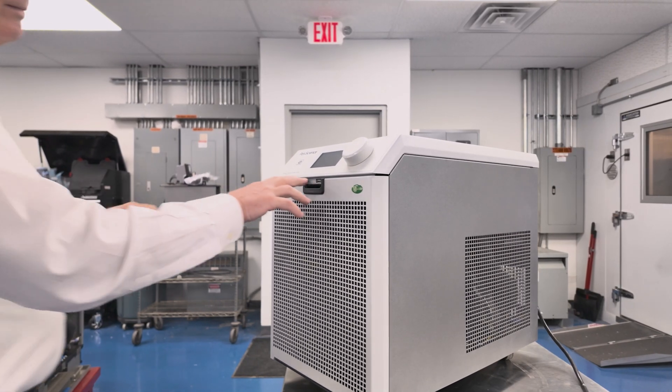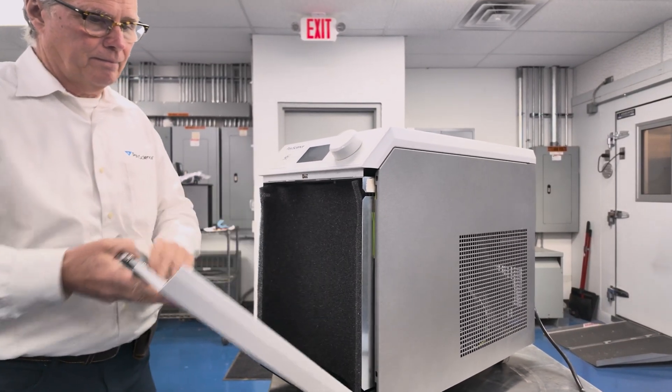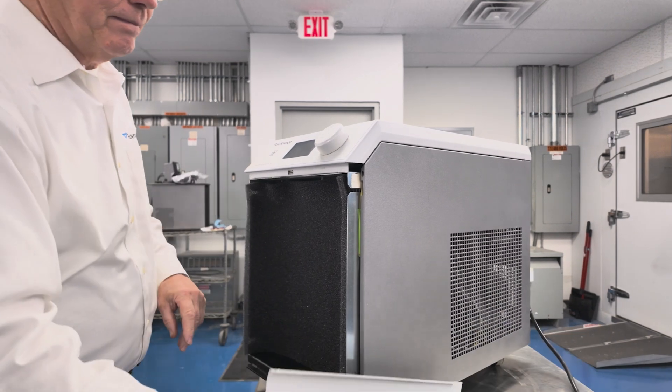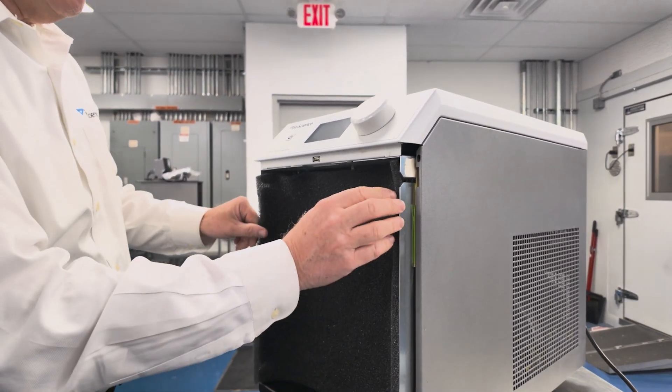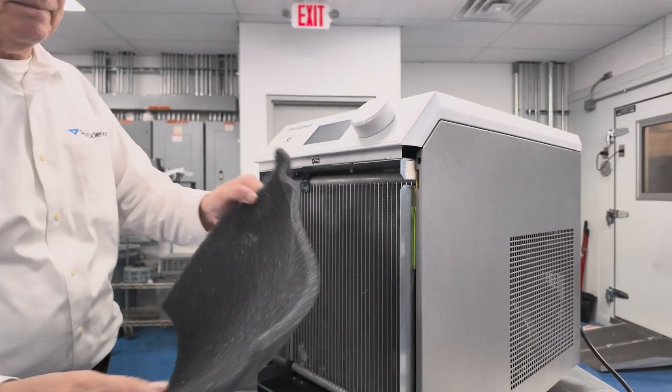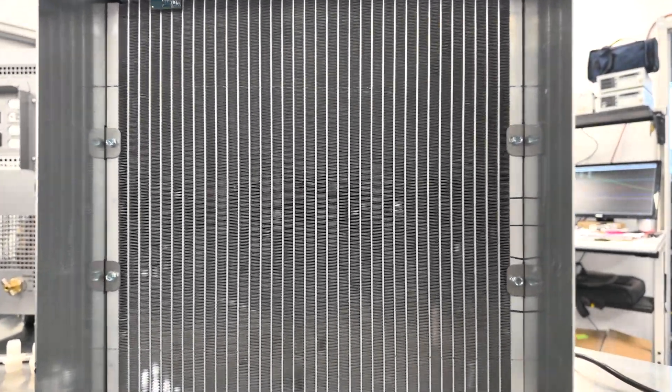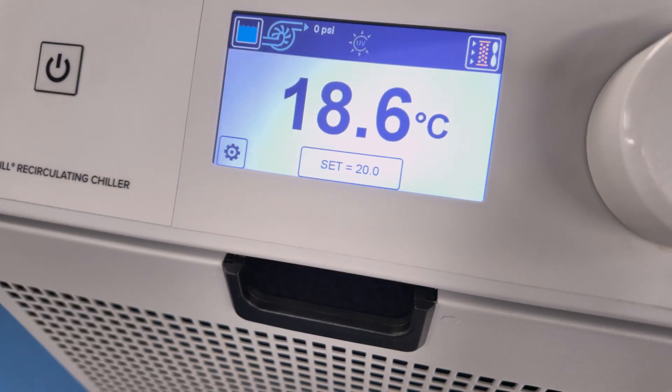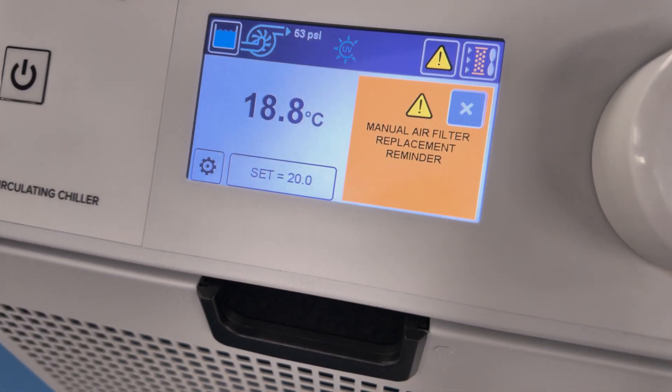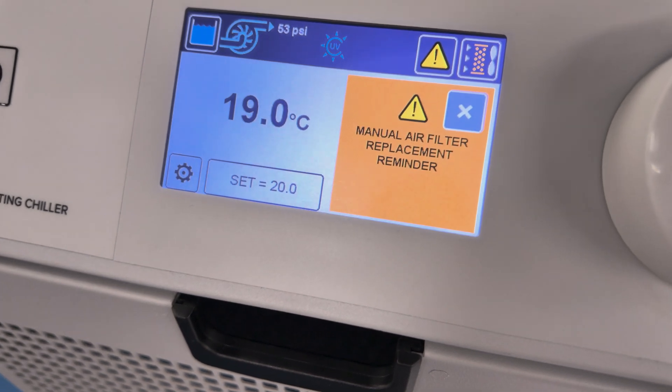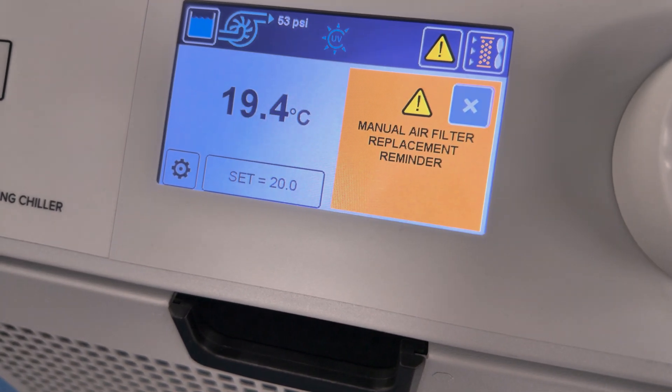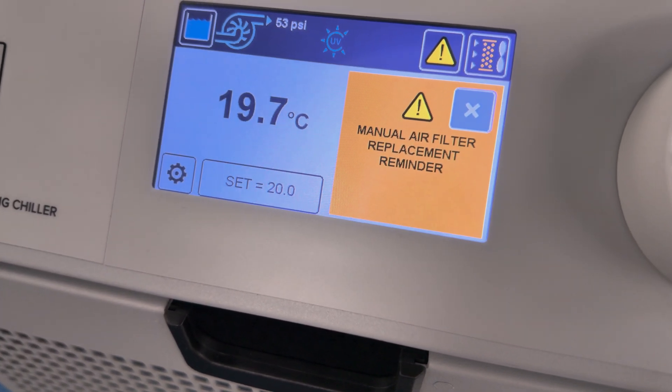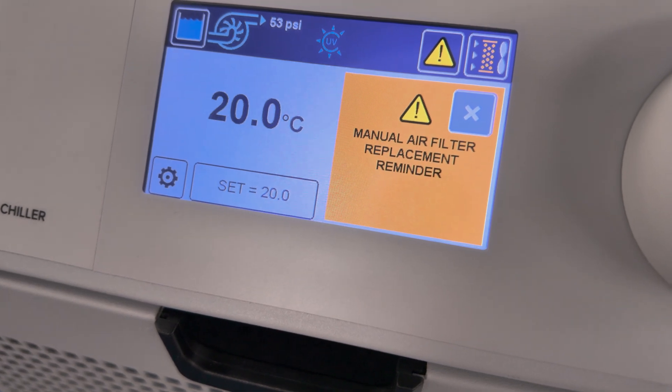If using the standard filter, train the user on how to clean the filter and condenser. Also explain that the unit will give visual and audible service reminders to clean the filter and condenser.